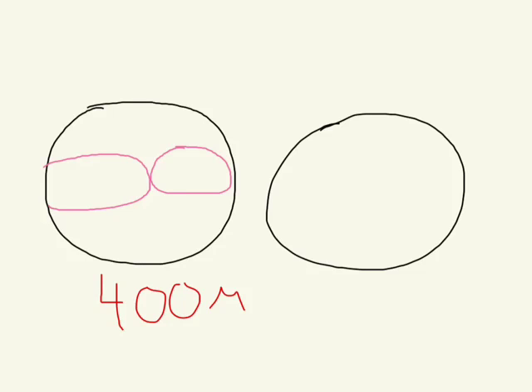Now another quick thing I'll review is some people were having trouble with determining the size of what you are observing. So let's say we are looking at, this is two different examples here. We'll start out with this one, that we're looking at two cells on high power at, let's just say we know the field of view is 400 microns.